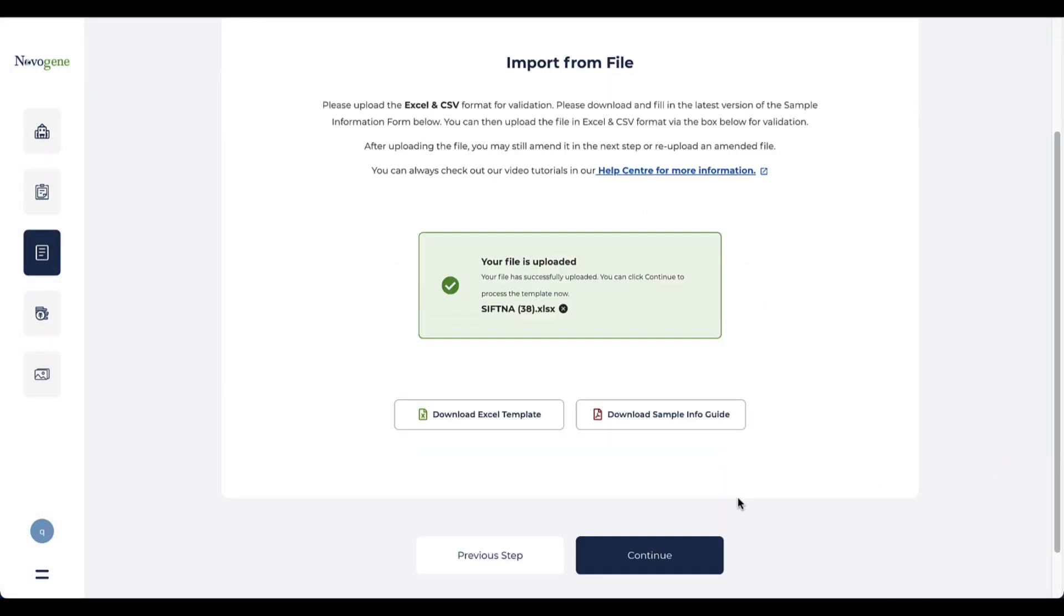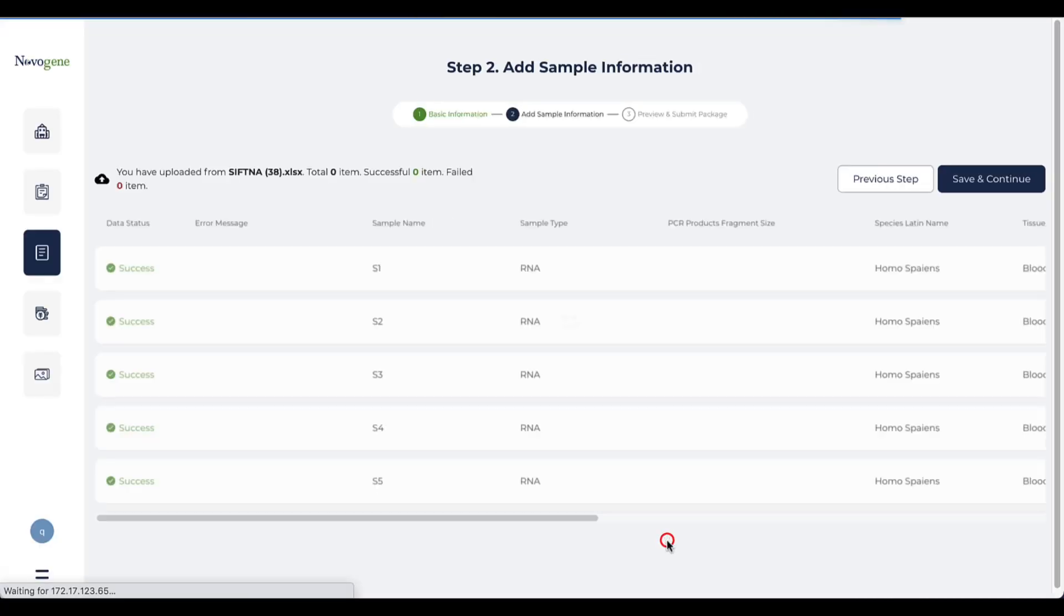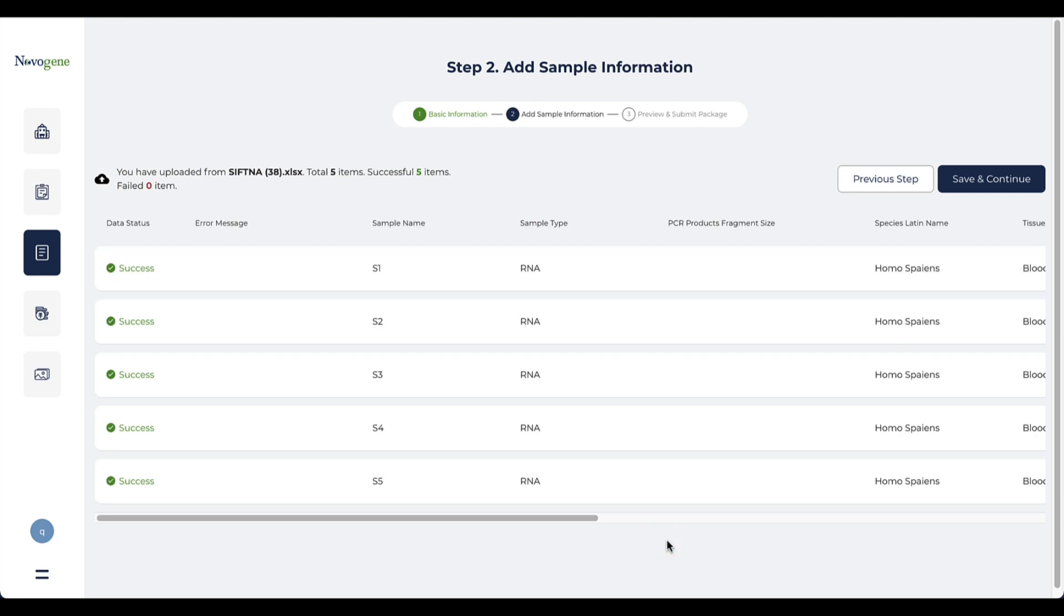The system will double check if all information on the Excel table are correct. The failed rows will be marked in this list with a reason.